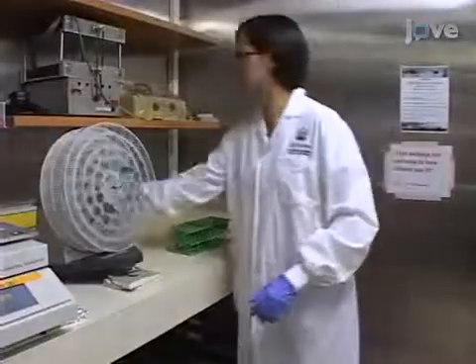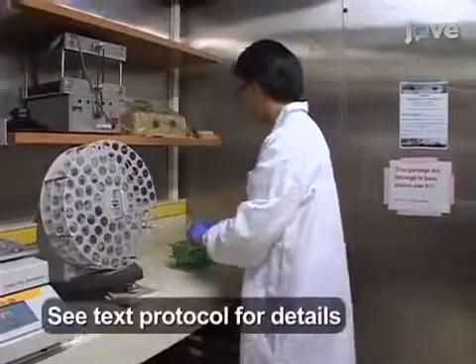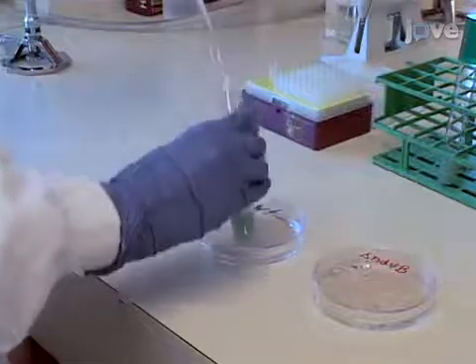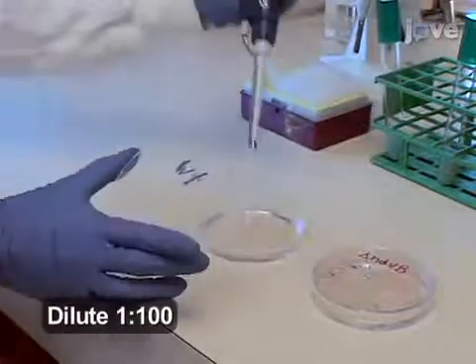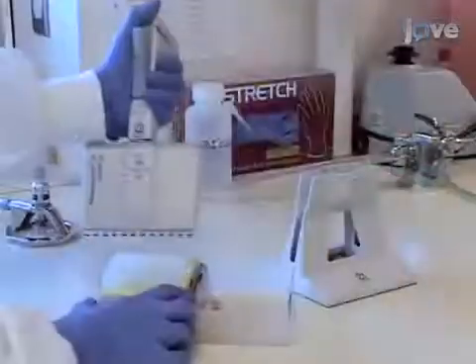Culture the wild type and mutant strain of bacteria for 16 hours in a rich medium at 37 degrees Celsius. Dilute the saturated overnight cultures into a fresh medium, like M63 minimal medium supplemented with magnesium sulfate and arginine.